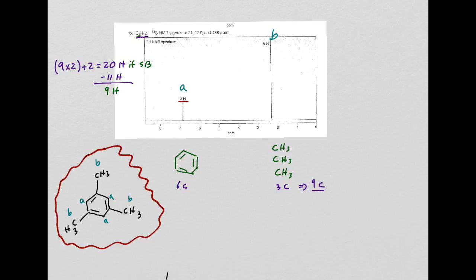All right. Before we do the last one, the other thing I want to reiterate one more time is that we knew we had no oxygen here. And when I have a peak at 2.2 ppm, it's likely that you have carbon that is directly attached to a benzene ring. We saw it over here, and we're seeing it here right now. Okay. Let's do the last one.